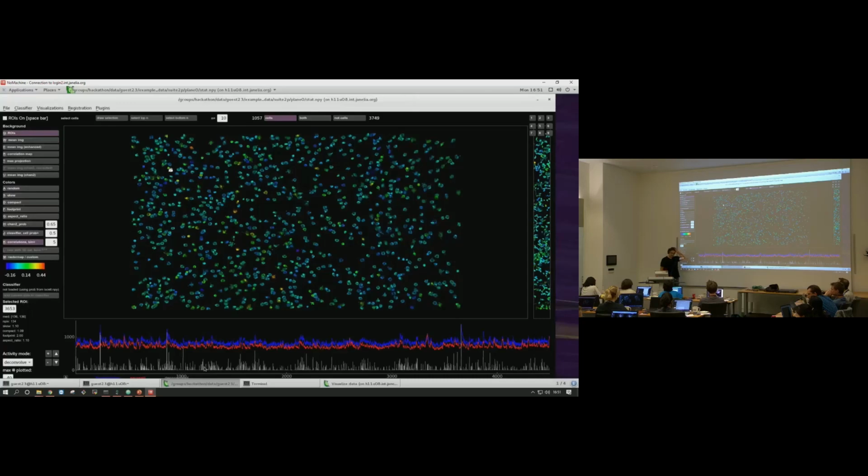And so in particular, if you're doing things where you show stimuli, let's say, at 1 hertz, one after the other, and you're using GCamp, let's say the slow version, then the GCamp will not have decayed completely by the time the new stimulus is presented. And so it'll always ride on top of the previous stimulus. And so if you can at least deconvolve these patterns in time, you'll get enough temporal localization that you don't have to wait for the GCamp to fully decay. You can start trusting the temporal localization of the deconvolution algorithm.